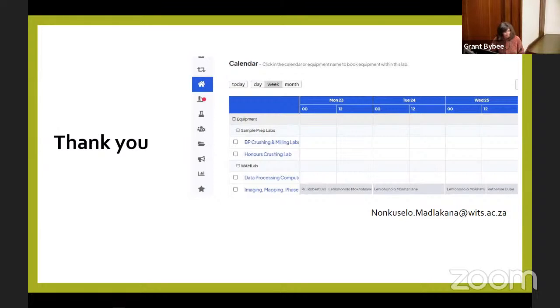Yes, it's actually possible. How this works is that it takes a grain, and then it does different spectra in low counts, and it averages all of them. It's like 3,000 spectra, and it averages all of them to give you a perfect high count. That's how it works. And then yes, you can have your unique library. The moment you analyze things, you can save them, and that becomes your own playground.